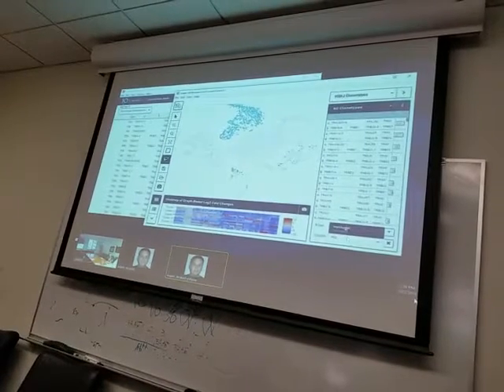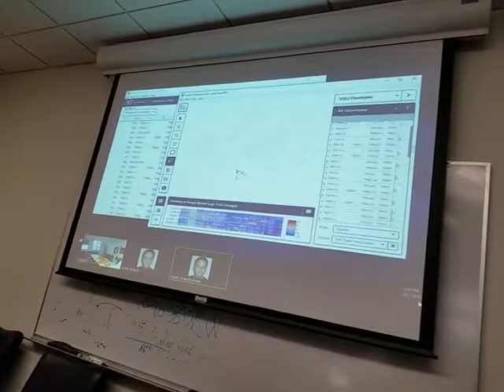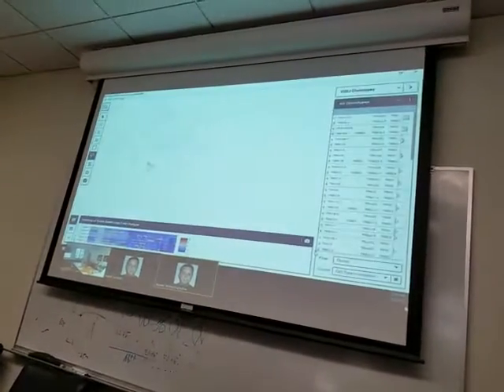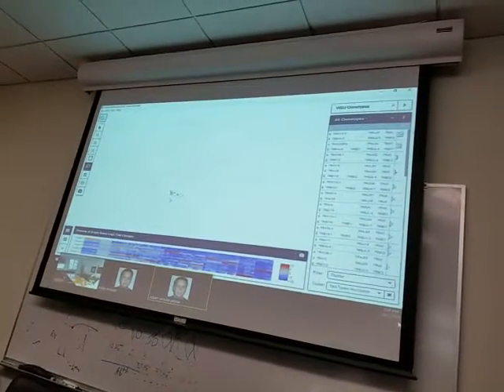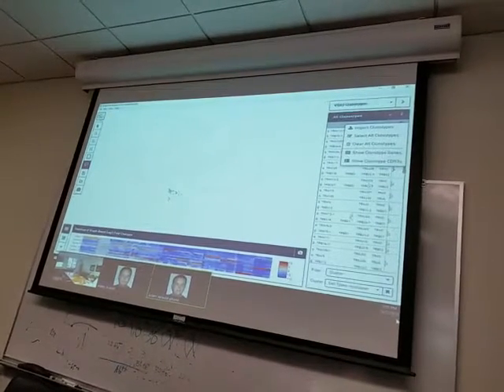Yeah, there we go. So now we have the shortened list of just the clonotypes reported in here, and then we can export that as well.